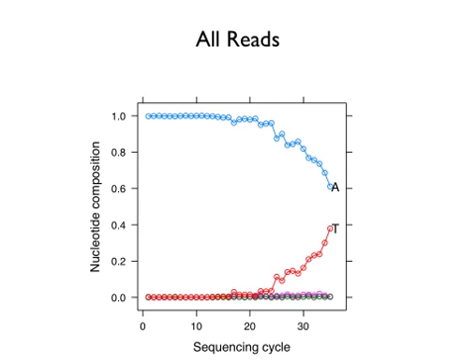Is this limited to Illumina, or can you see it across different platforms? We see it in SOLiD too, and I can't say for 454. It's gotten much better since the first data sets we got. That's for sure. But why does the composition change along the sequencing cycle? Why does it get worse towards the end, or why is it just A and T?